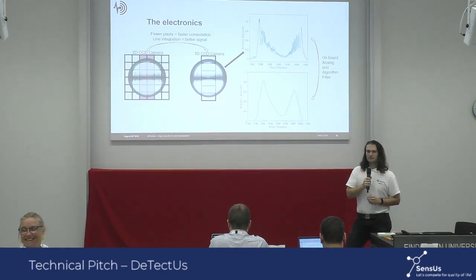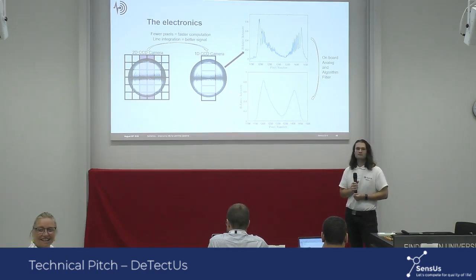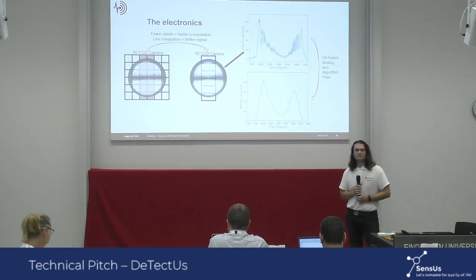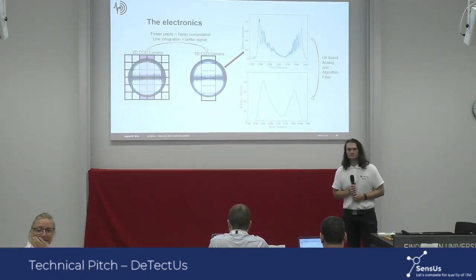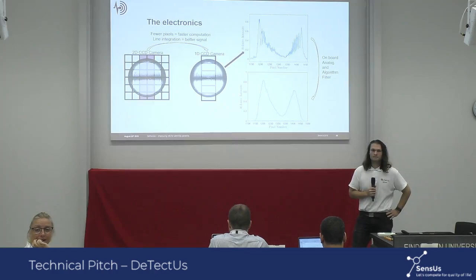Okay, last answer, because we have to move on. Hi, I'm Sarah. For the first part, we try to homogenize as much as possible. We had a very small amount of it, but we tried, by shaking and increasing the amount of fluid, to do it. And because we were using lysine for the interaction, it's a specific tail that we are going to attach to it to increase the possibility of homogenizing. But we know that there are some spots there, but somehow it was helping us because we needed a trimeric TNF to expose the maximum conformation that we needed for interaction. So kind of it helped us.